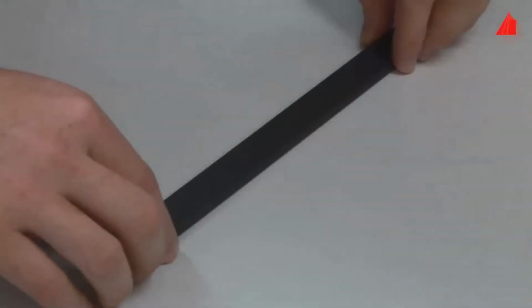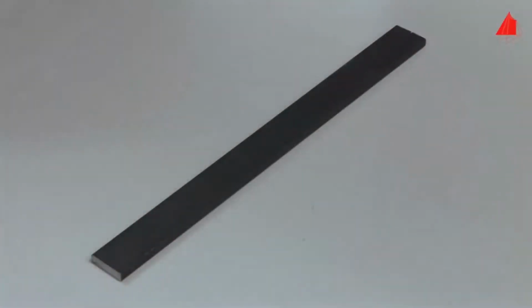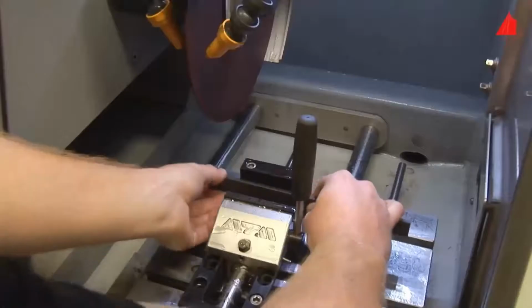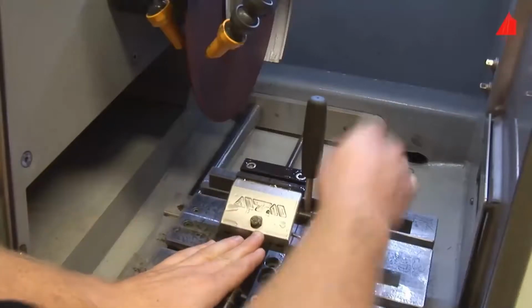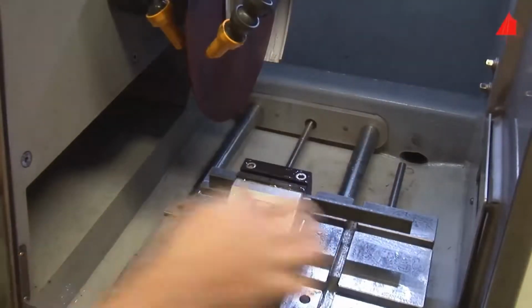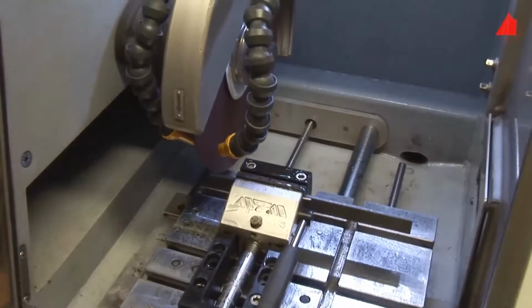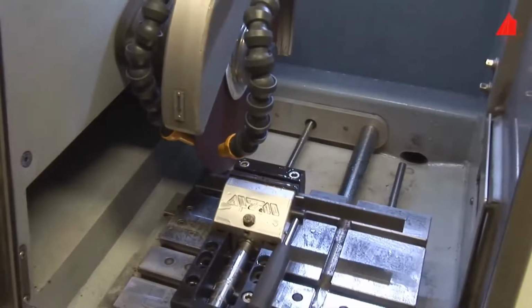To start with, one of our material testers defines the intended sectional plane and marks it on the bar. In this case, it's a longitudinal section. Then he takes the bar to the abrasive saw to cut out a small sample. He fixes the bar securely, prepares the machine, selects the cutting parameters, and starts the first abrasive cut.